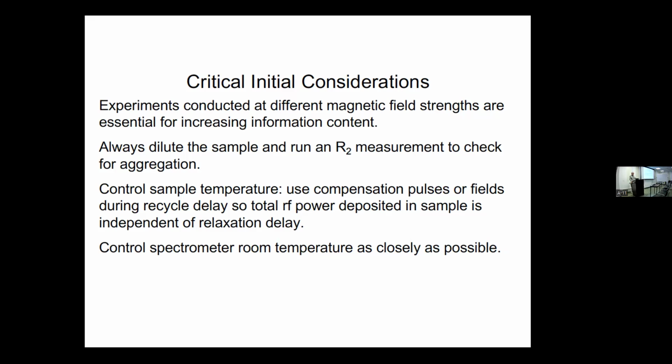And surprisingly, spectrometer room temperature is important. Any idea why? All the solid state people should know why. Why would room temperature, the temperature of the NMR room, matter?